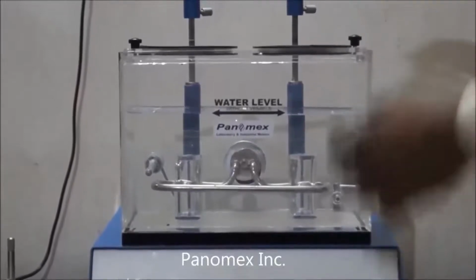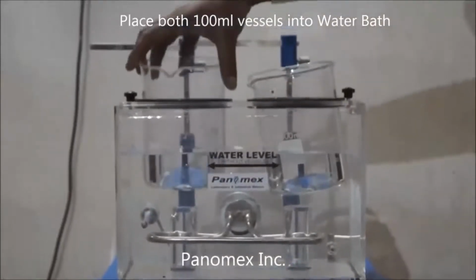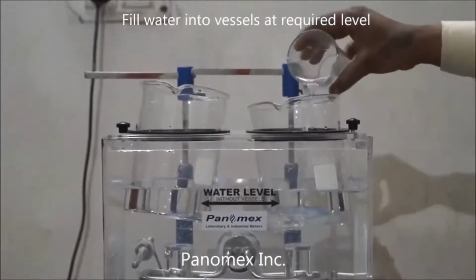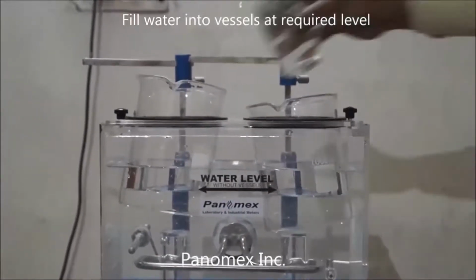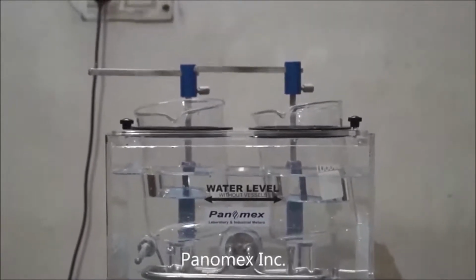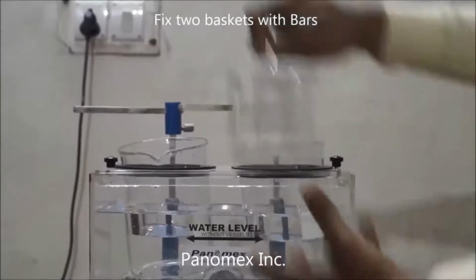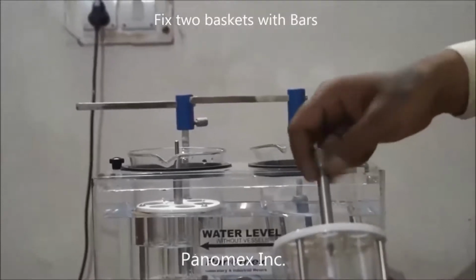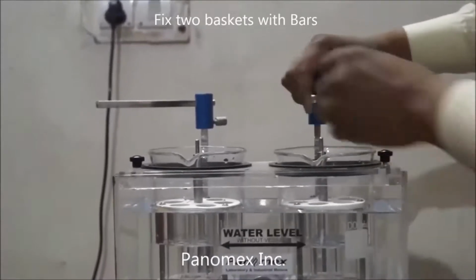After filling water in this apparatus, we need to put the vessels in this water bath. Then we have to fill the water into these vessels. They should be fixed, the bars with the bars.